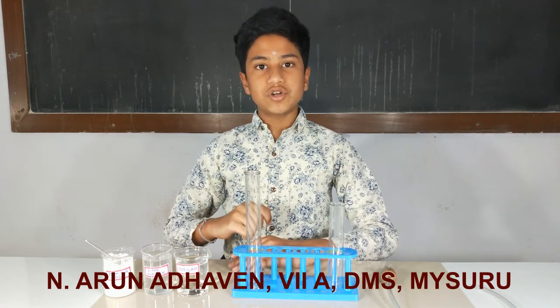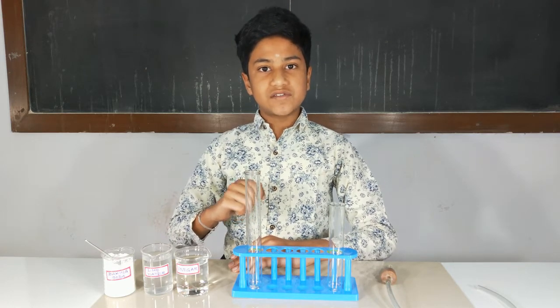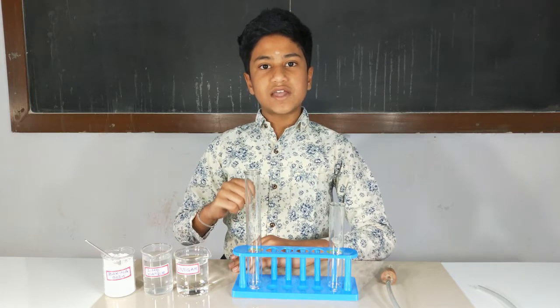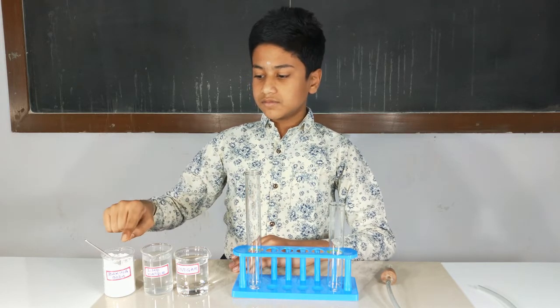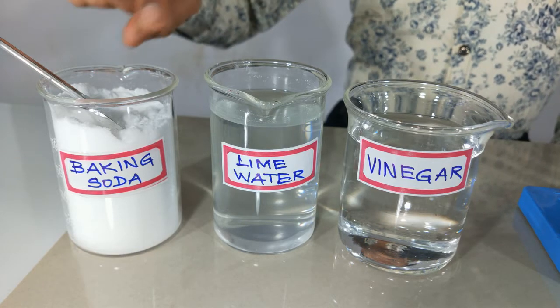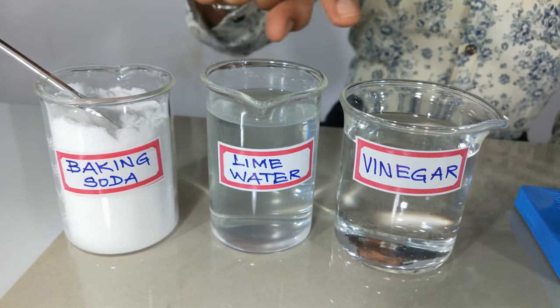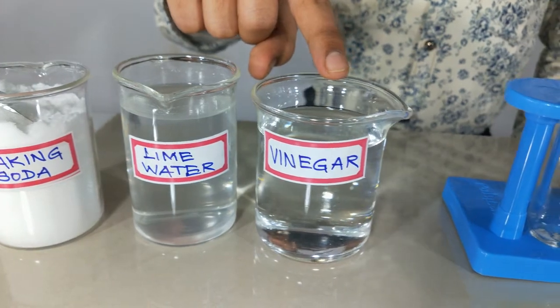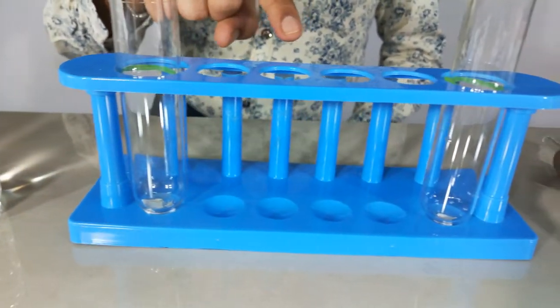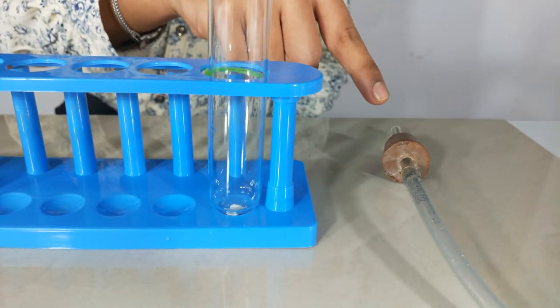Today I am going to demonstrate activity 6.8 of chapter 6, 7th Standard Science, CBSE. The materials required for this activity are baking soda, also known as sodium hydrogen carbonate, lime water, also known as calcium hydroxide, vinegar, also known as dilute acetic acid, test tube stand, single hole rubber cork fixed with delivery tube.